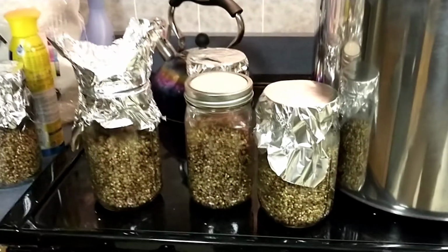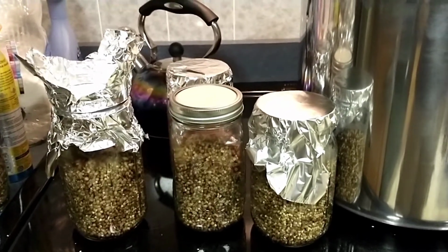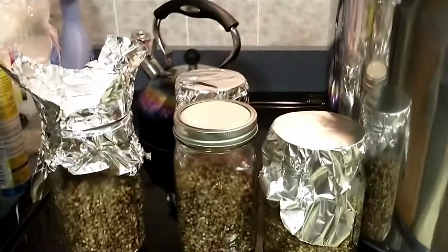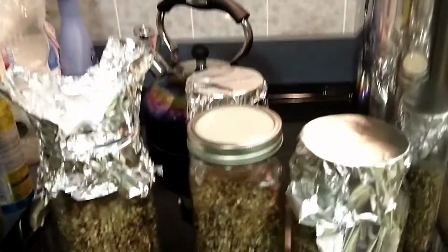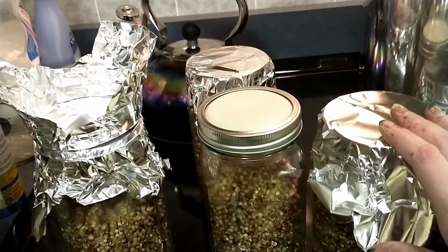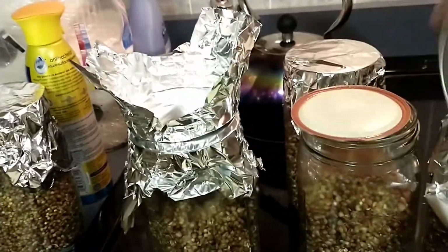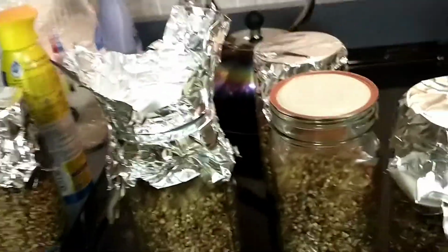Alright, so my jars are a little over 3/4 full, leaving a little bit of room to shake, break and shake when it's time. And it's time to put on the aluminum foil. Just to give you an idea with the covers though, with the modified covers, you just put those on like normal. With unmodified covers, instead of putting it seal down, you flip it seal side up and you just screw it on.